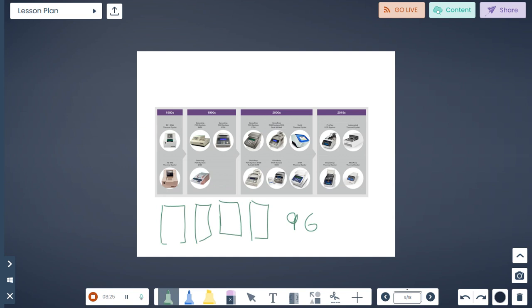But it will not be accurate, because when you open the lid, a slight change in temperature happens. Now you can set in each block the temperature you want. You can have a temperature range. Suppose you can maintain a 0.1 to 2-degree difference between two blocks. So there are PCR machines available like that which you can use.